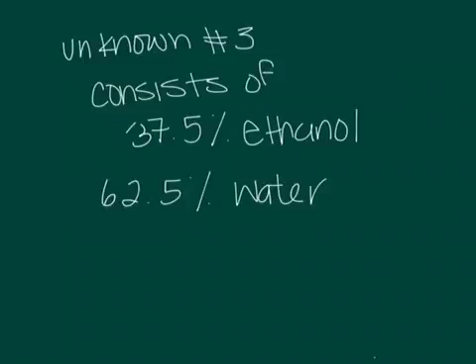As I mentioned before, this was determined by the percent composition calculation, which used the change in temperature from fractional distillation, because in simple distillation, it was less of a drastic change in temperature, so it was a little bit harder to see where the ethanol ended and water began.